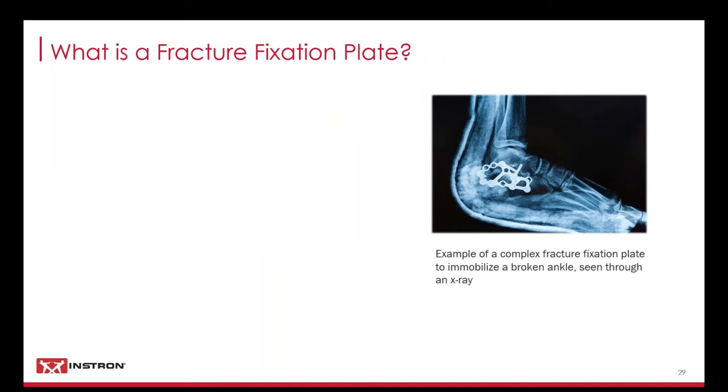A good example is also a fracture fixation plate. The idea is that it is used to immobilize, say, a broken ankle in this image, as you can see through an X-ray. So we've got the metal plate here and several screws going into the bones.